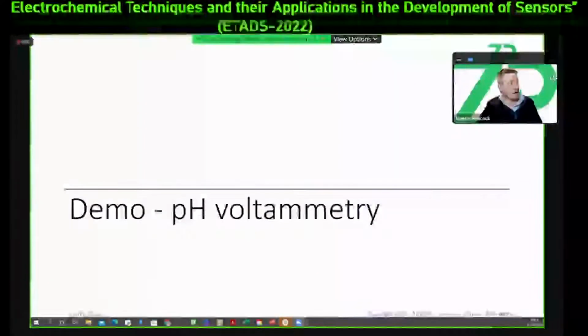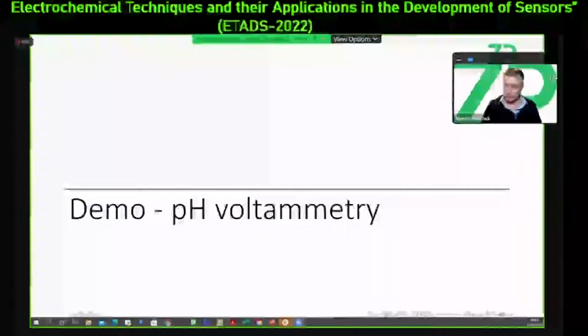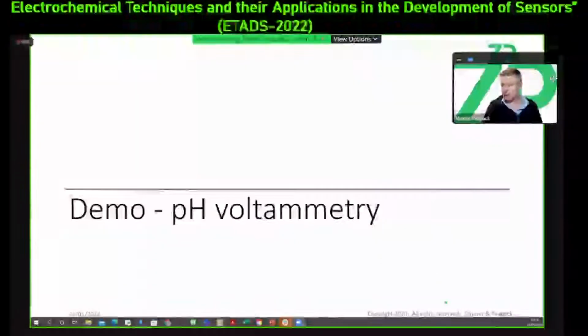As Andre says, I was calling it potentiometric, but in the software, you're looking for something called OCP, open circuit potential, which really just means measuring the voltage at very high impedance. And Andre was changing the pH, and as he changed the pH, the voltage was moving accordingly. So thank you to Andre and Solron for that.